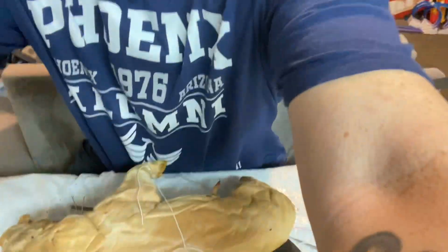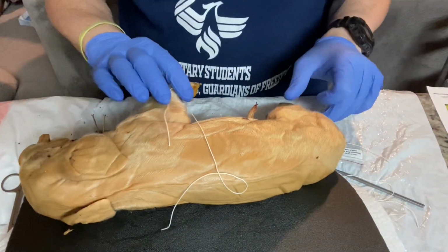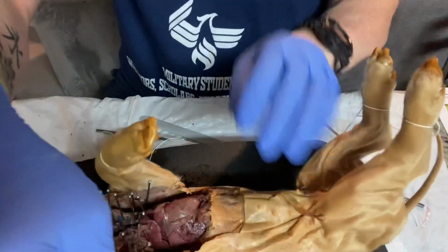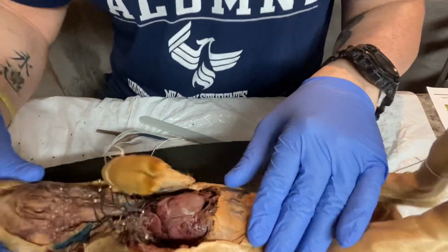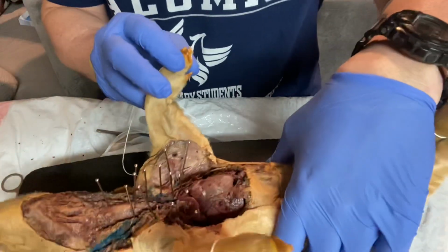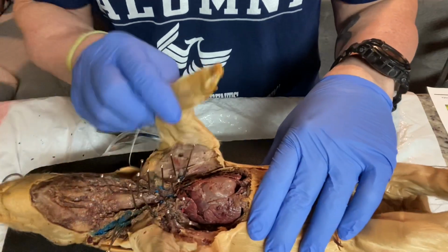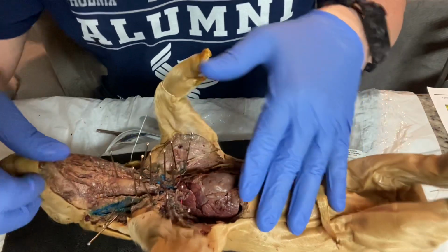I've already cut the pig to expose the internal anatomy of the pig. And let me just adjust my camera if I can here. And I'll try to go over some of the structures here. And I put some pins here to just kind of help mark some landmarks.